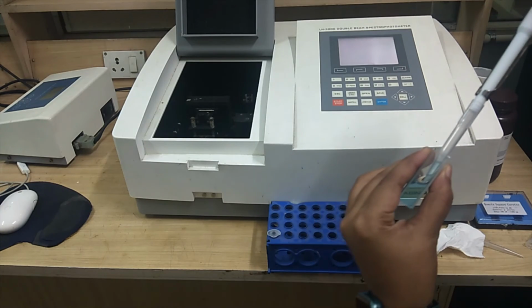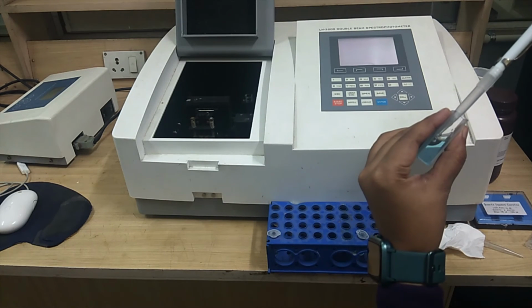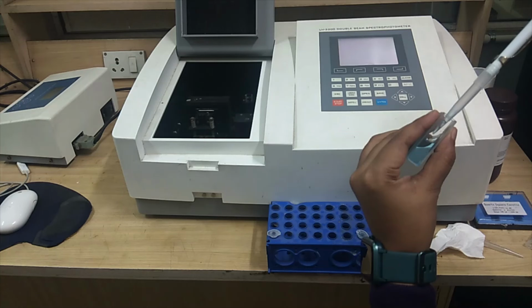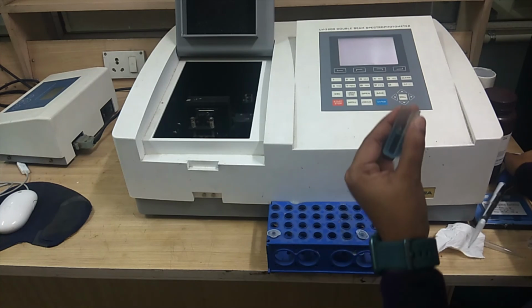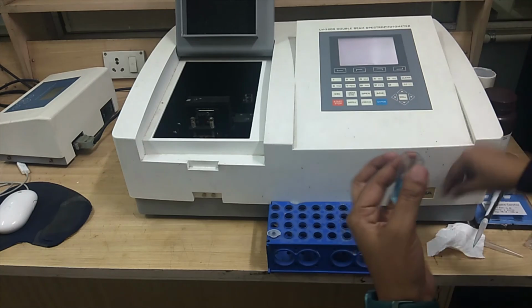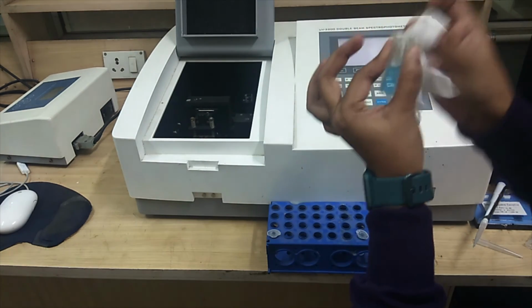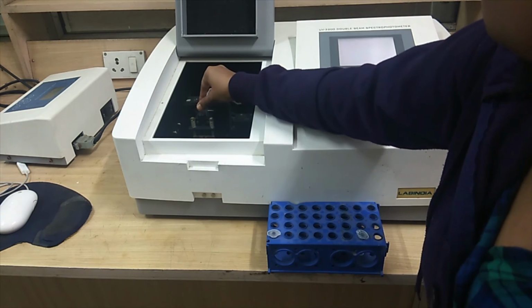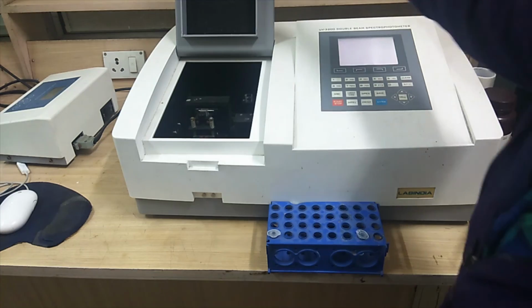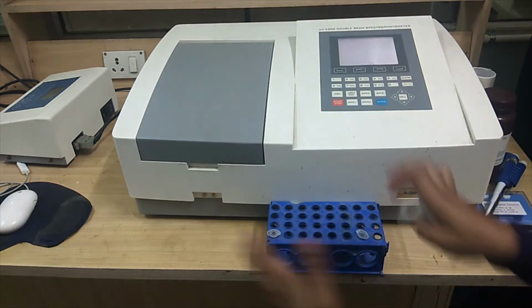And this is our final solution. I have added Bradford here. Make sure that you avoid any kind of bubble because it is going to affect the reading also. This is the third sample, and I'll wipe it to avoid any fingerprints and place it here. Throughout the process, it's quite obvious that you have to close the lid to maintain darkness over here.